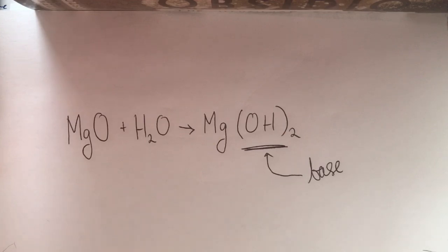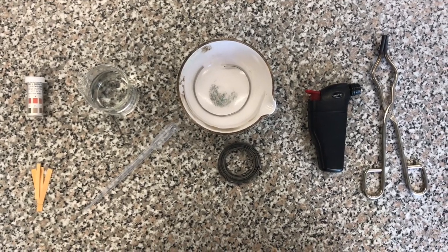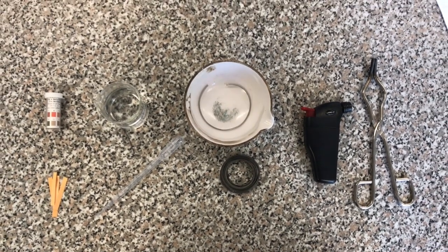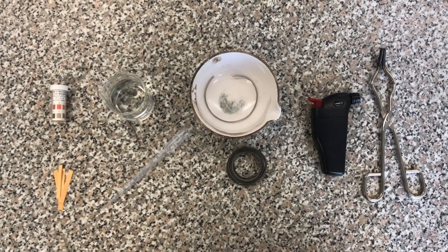However, to be sure of this, we must conduct the experiment. To do this, we will need a pipette, tongs, a magnesium roll, water, litmus paper, and a lighter.